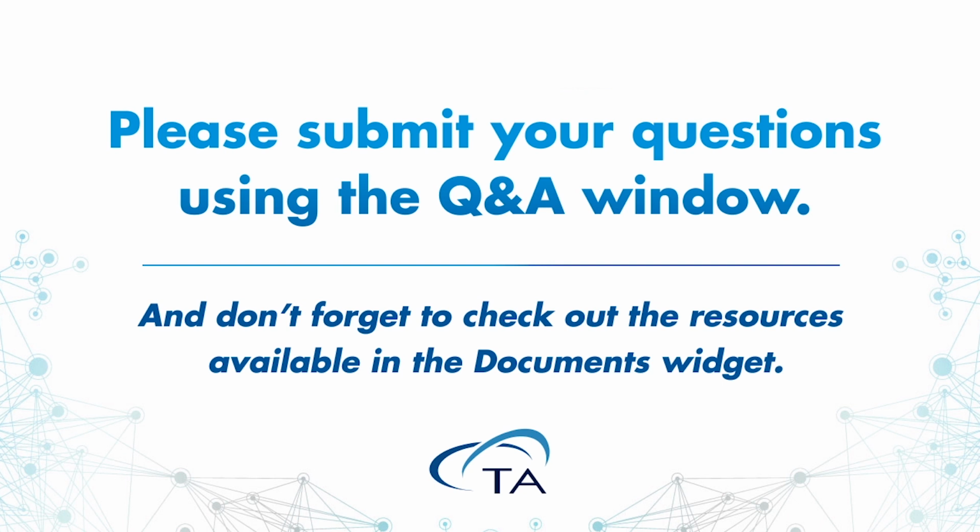Okay, perfect. Well, I think we have time for just maybe two more questions. So one is a question about the Langmuir trough. The direct question is whether this is a substitute for the Langmuir trough, or maybe you could expand on whether this has been used in conjunction with or complementary to measurements of a Langmuir trough. Yes.